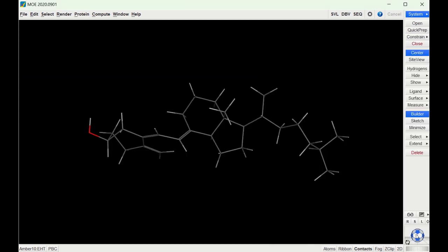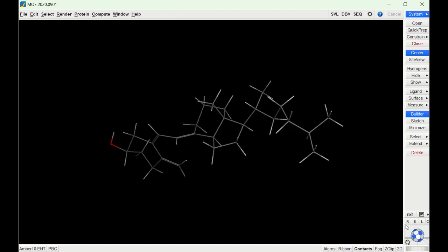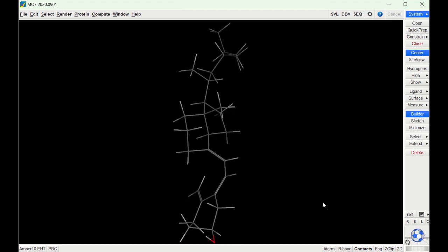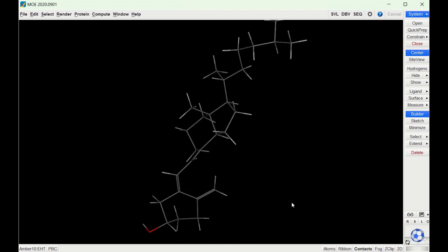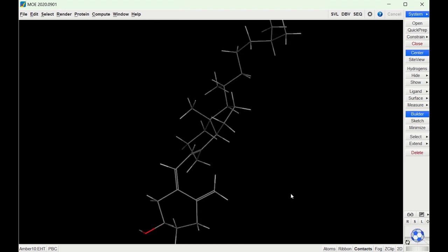I can then view this structure in MOE if I click the dropdown and click Send to MOE. You can see it puts the structure in MOE where I can then move it around and manipulate it how I want. So that was the first way to draw structures in MOE.